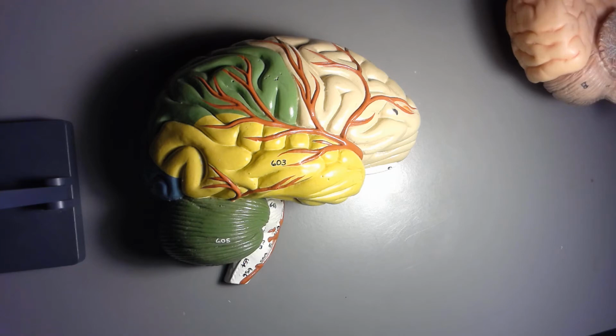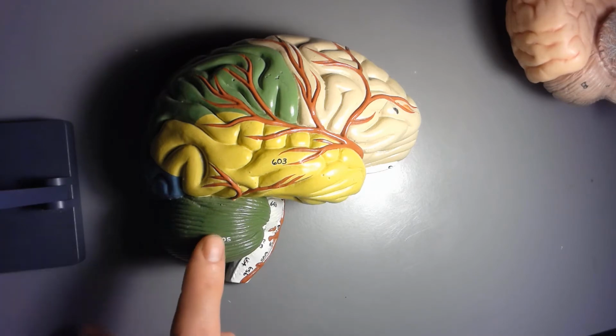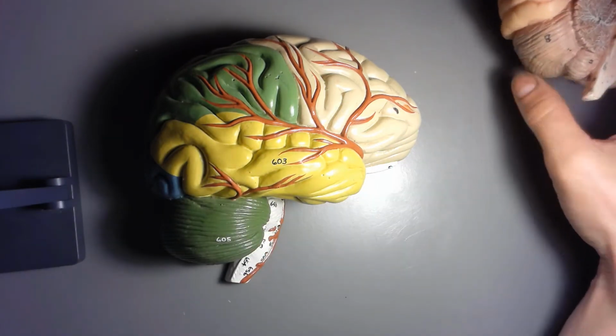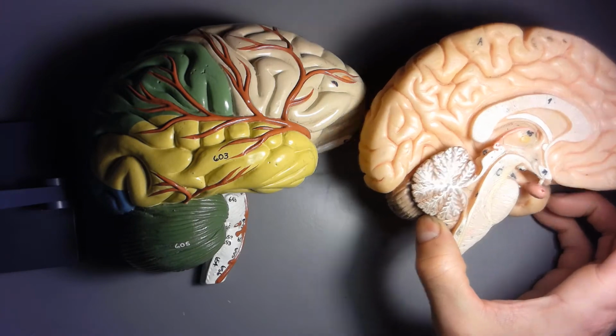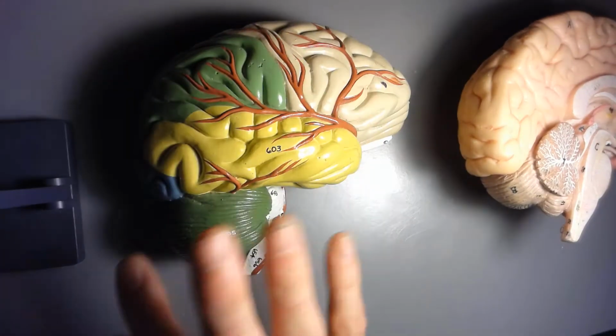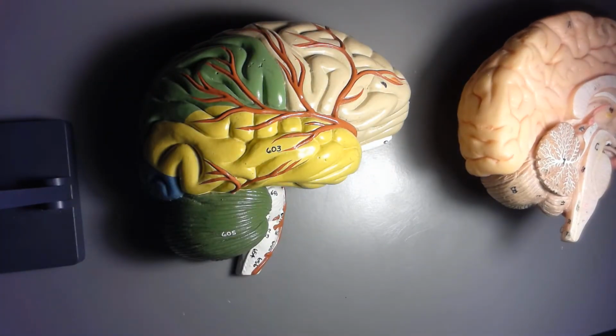Hello AMP1. In this video I'm going to be going over the sheep brain lab, and I'll be going over the parts that are listed upon this lab handout here. So I will be starting off with the brain model itself using several different brain models. I'll be using this one to start off with, and then later I'll refer to this one, and then after I'm done showing you all the parts with the models, I'll be bringing up a real brain, the sheep brain, and showing you the parts on that as well.